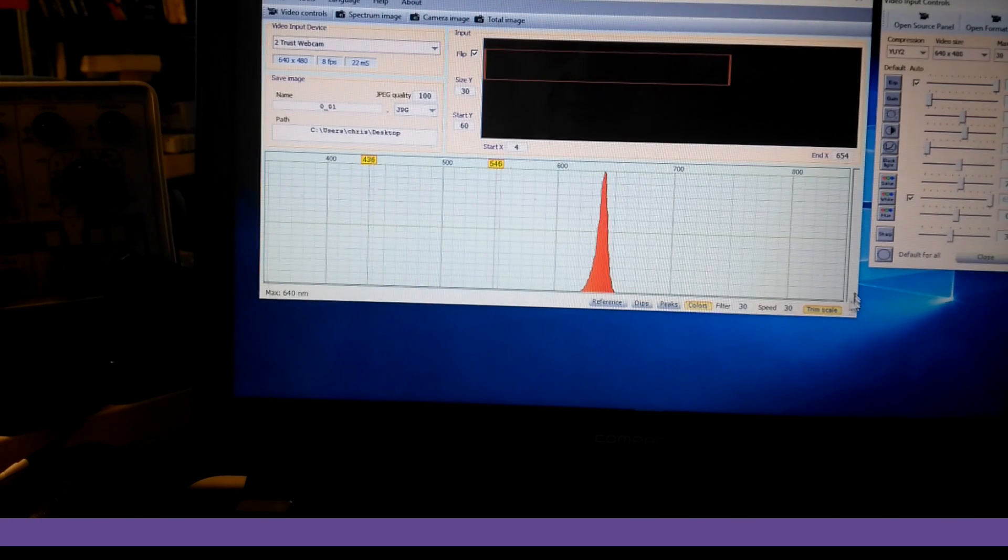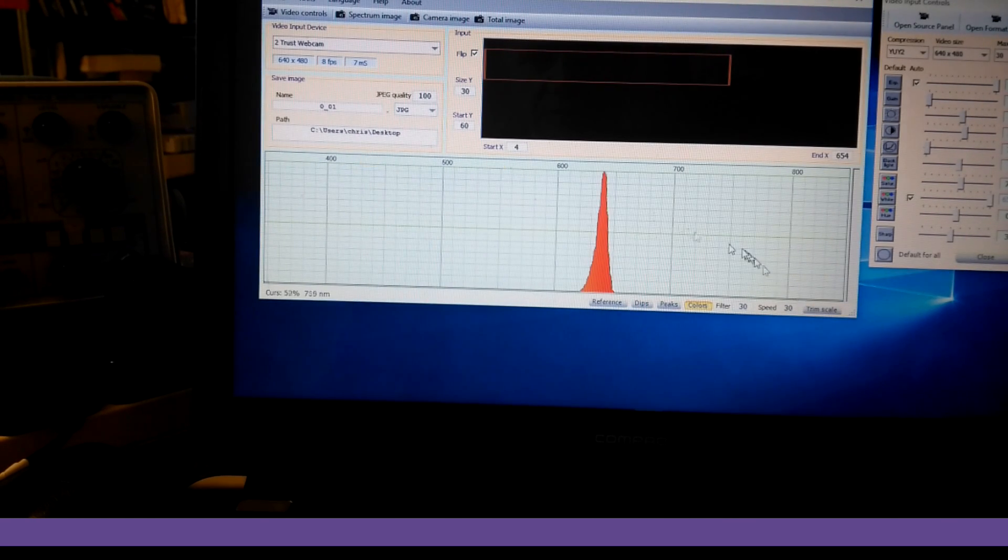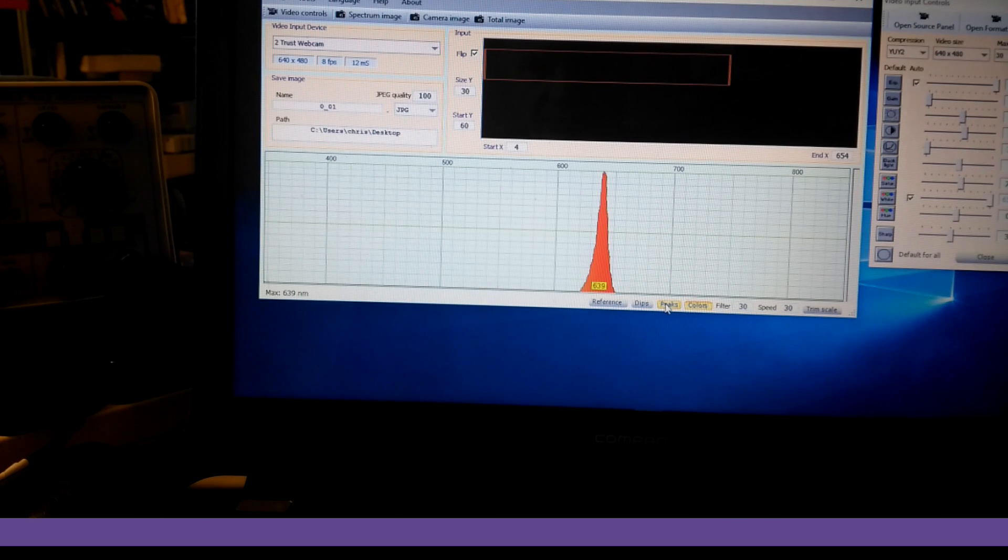There is the laser, and it's reading at what, 600 and... We'll take the trim off, and then we'll actually read the value. Peaks.